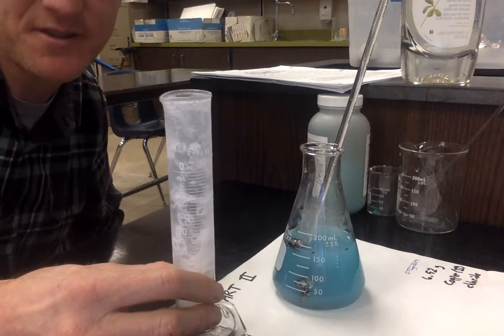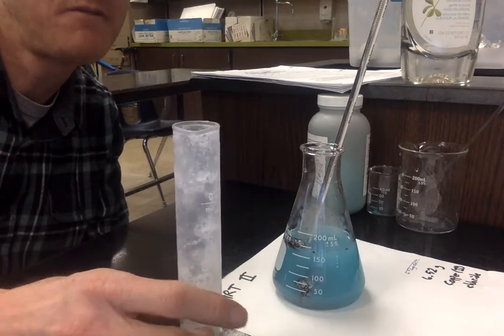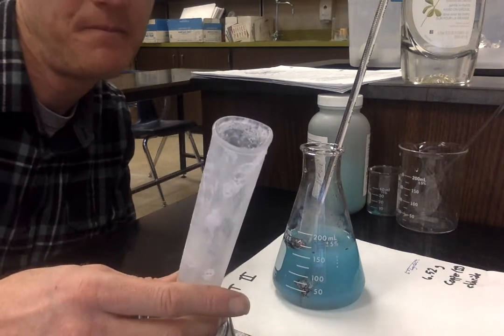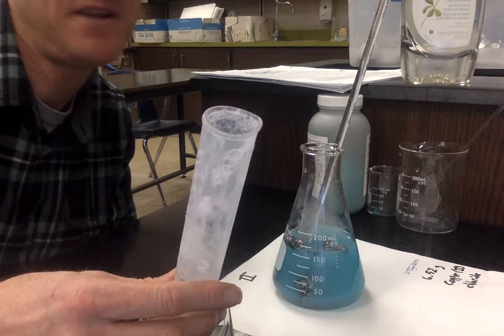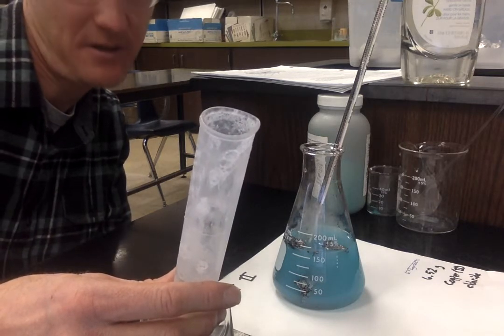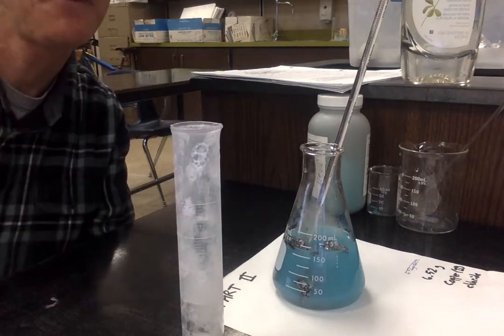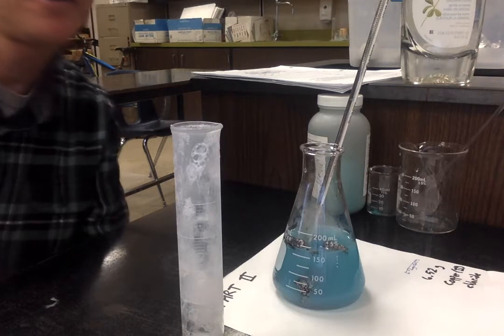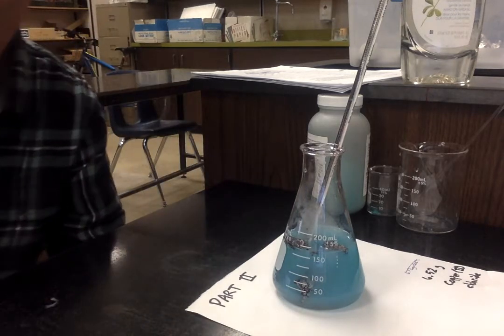As you can see, this had the calcium. The volume of this graduated cylinder is, well, we have 50, and then there's about 15. So once it's actually completely full, the graduated cylinder would be a volume of about 65 milliliters.